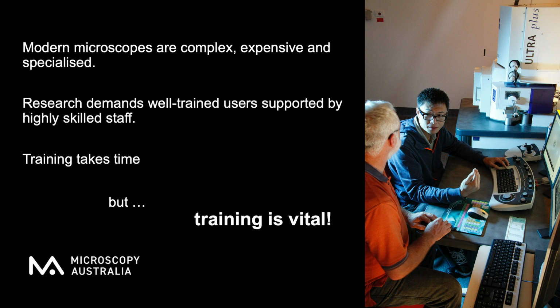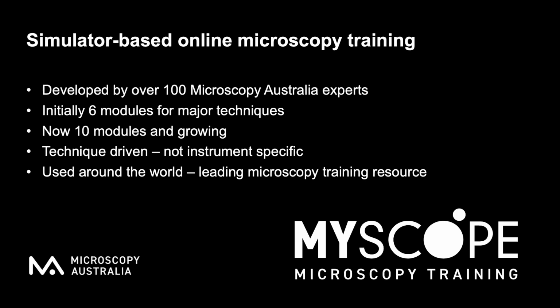So what we decided to do, because we have so many new users coming in each year, we decided to take an approach to save time from our expert staff who, rather than helping the experienced users to get some really top-notch results, were spending an awful lot of their time training some very basic users. So we developed this MyScope online training. It was developed by over 100 of our Microscopy Australia experts.